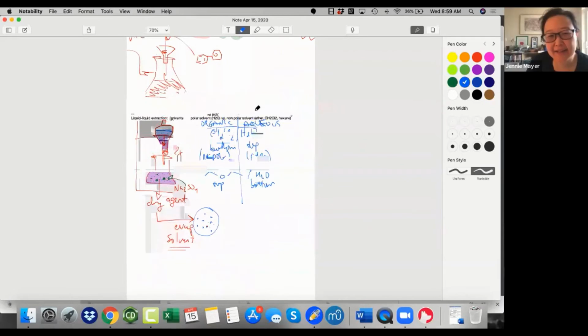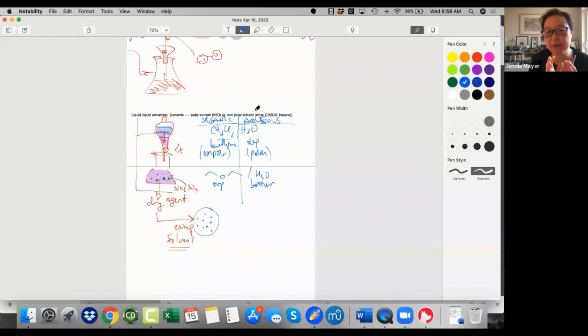Yeah, I like that a lot, Tony. That's right. So if the difference in polarity of the compounds you're separating is great enough that a significant amount will go in the aqueous or organic layer, there's more of a polarization, right? Either you're very nonpolar and polar, then this would work really well.